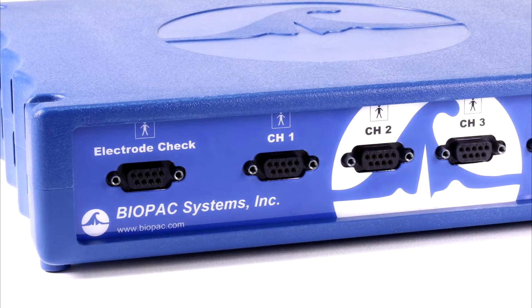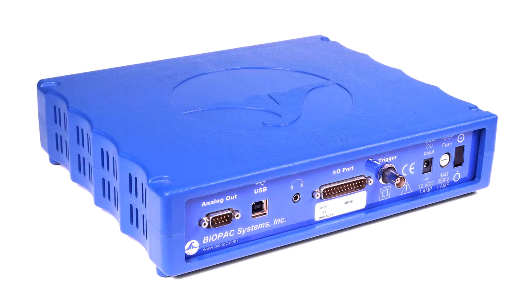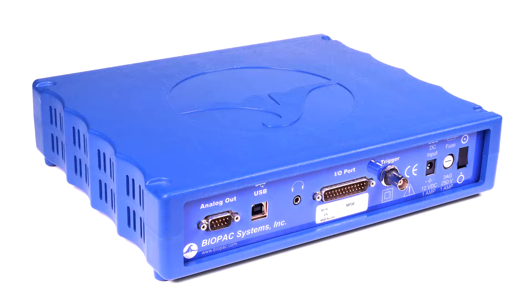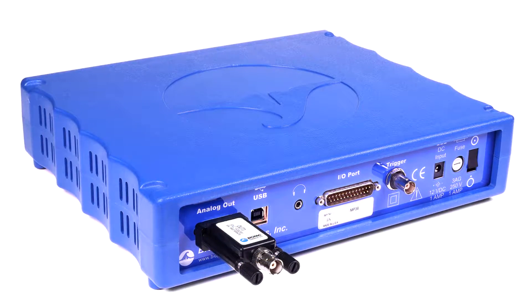The electrode checker confirms signal quality before recording begins to help students collect good data. The MP36 also has a built-in low-voltage stimulator for animal studies, accessible by adding the OUT3 stimulator output adapter.